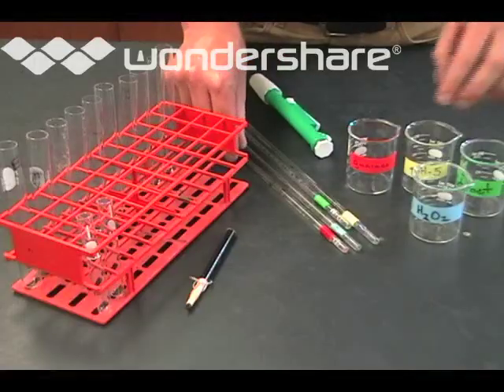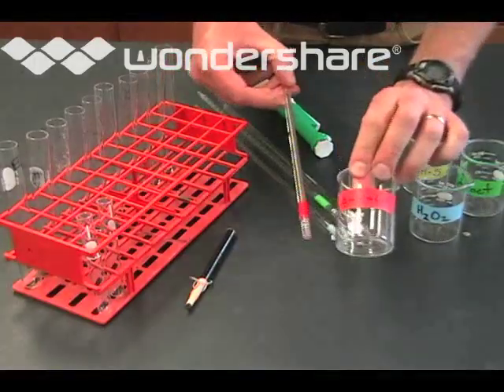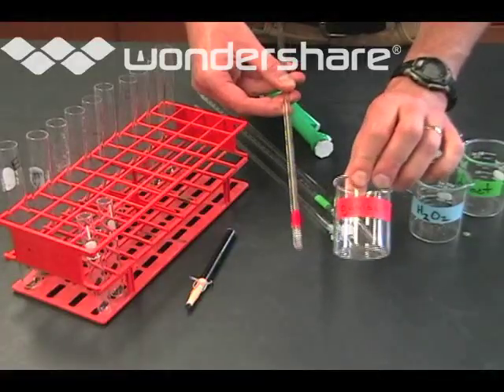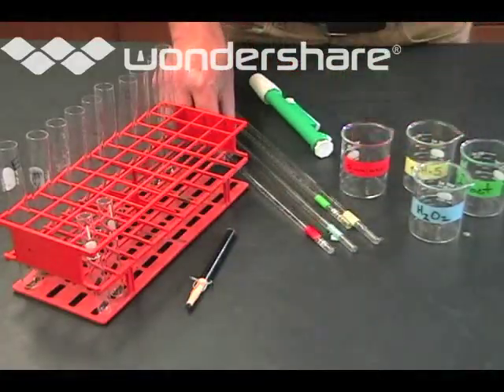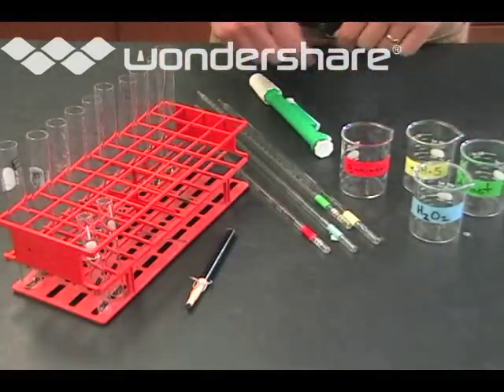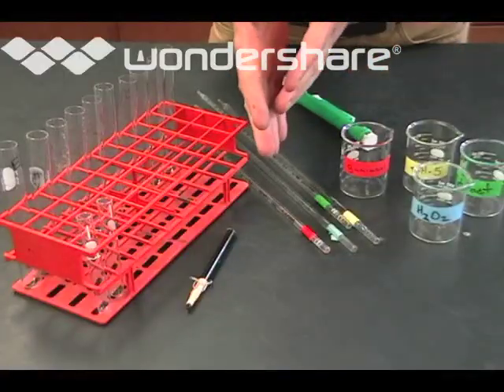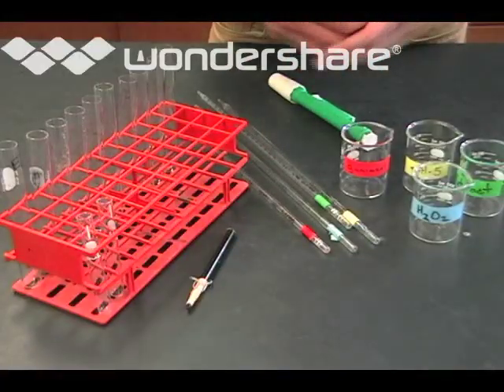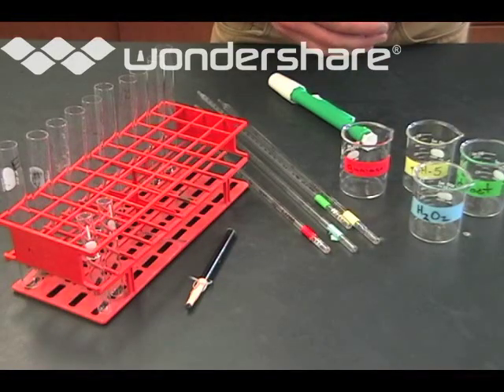Now the most important thing to notice here is the color coding. Each one of these has a color and they each have a matching pipette that has the same color tape on. You have to pay close attention to the colors to make sure that you're not contaminating one solution with the other, because if you get a little bit of the enzyme mixed in with some of the reactants, then your reaction is going to start before you're ready to look at it.